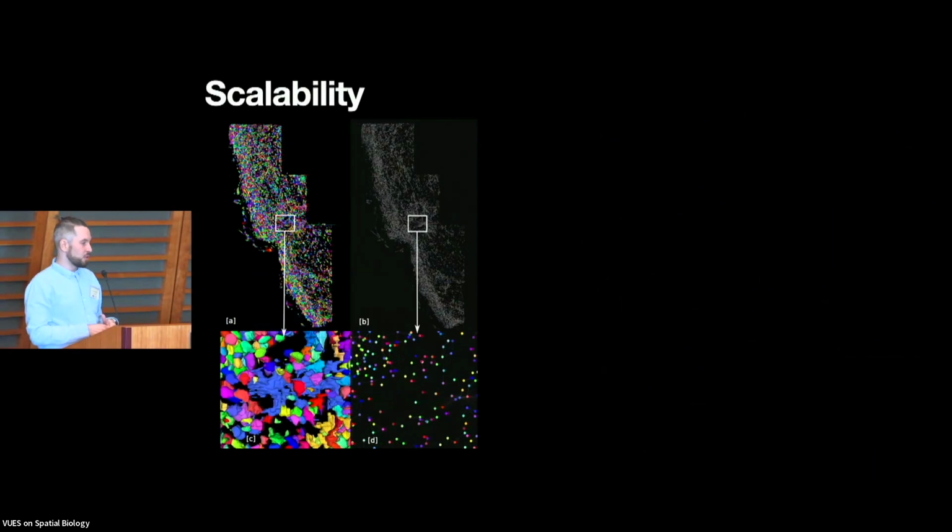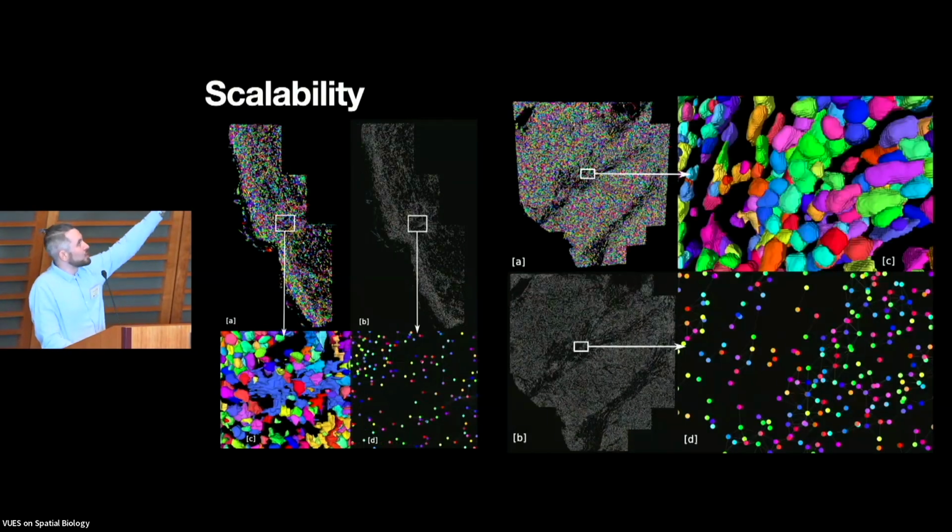So the way we circumvented that is to use NeuroGlancer. It's actually the tool connectomics uses a lot. So Jakob showed that before. And with that tool, we now have the right data formats to store all those meshes in various resolution levels. So when you zoom in, you get the very detailed overview of those cells, and when you zoom out, you just get a glimpse of all the cells and how they collocate.